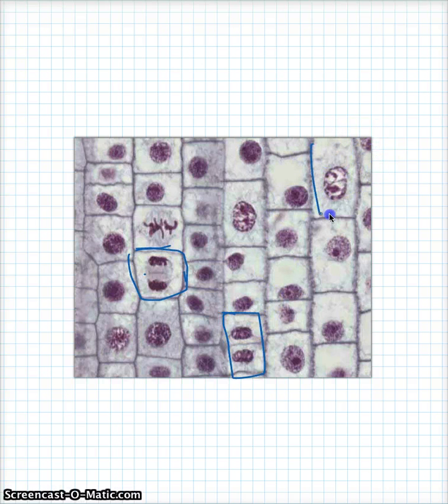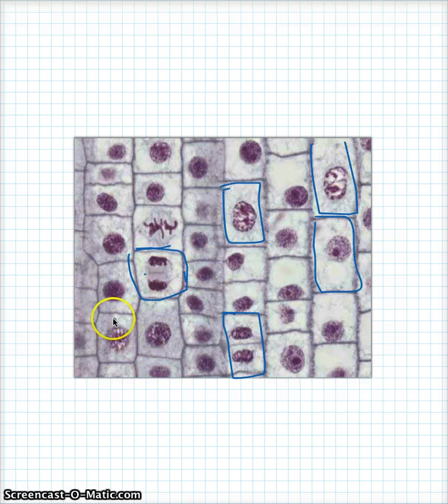What about this one? I would call this prophase. Interphase right here. Prophase here. This one's probably prophase.